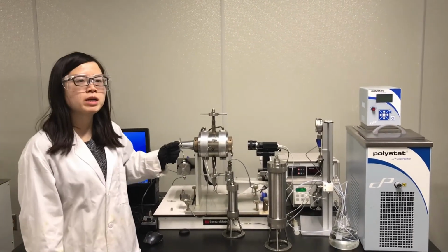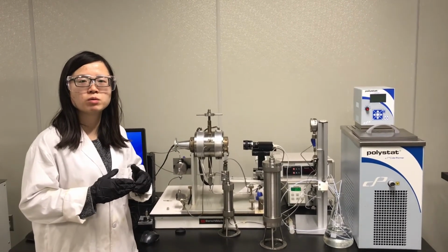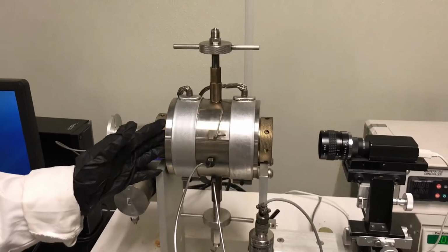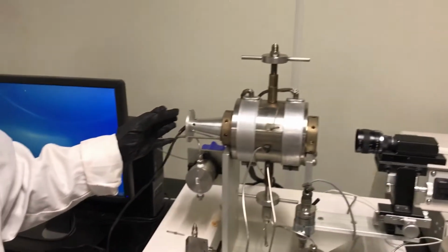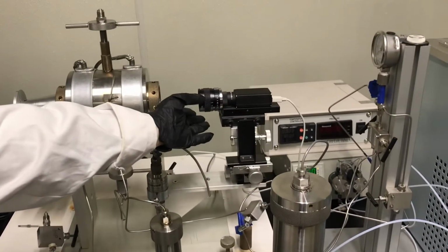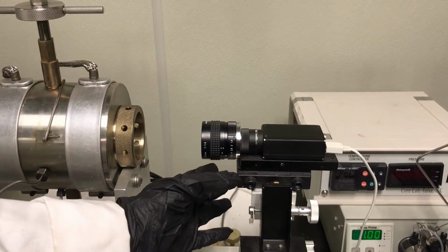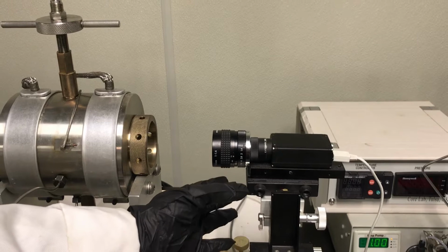First, as you may know, the interfacial tension is measured based on two immiscible liquids. And here we have the interfacial tension cell, which is used to load the two immiscible liquids. And here we have our light source. And then we have a camera here to take the images, because as you can see from the technical session, this measurement is based on image analysis.